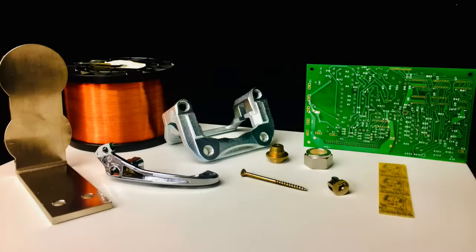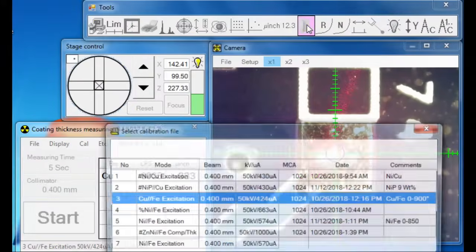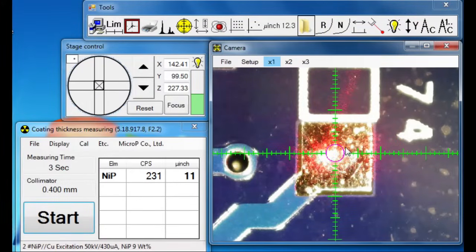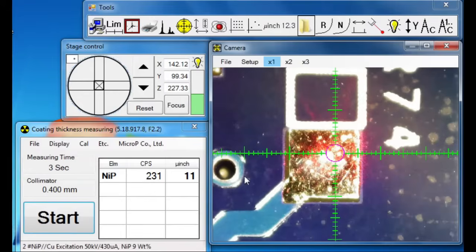Amply-sized chambers allow measurement of any size, shape, or types of parts. Intuitive, user-friendly operating software with drop-down menus makes operations simple even for non-technical operators.